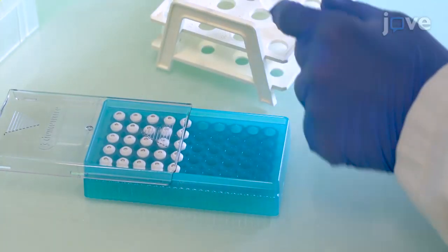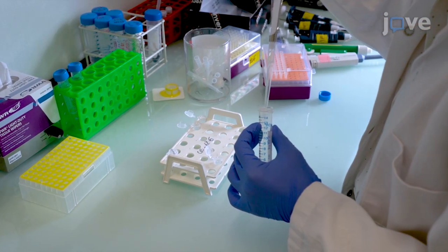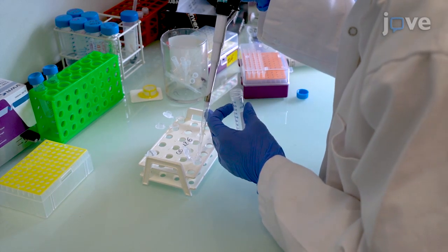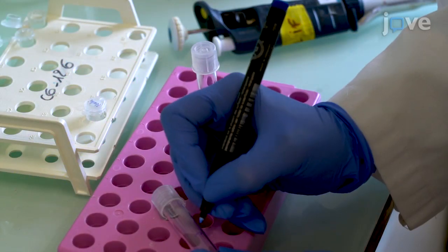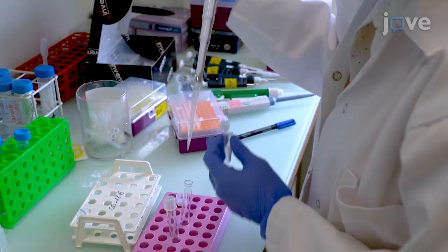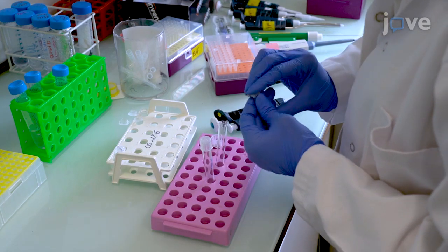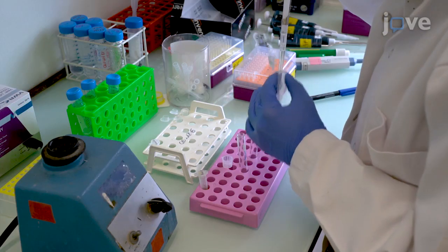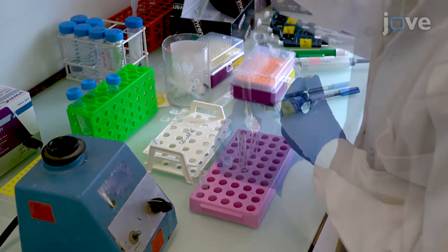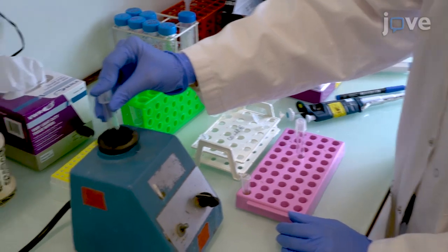Before performing FACS, filter the nuclei with a 40 micrometer cell strainer into a BSA-coated tube. Dilute the filtered suspension by adding PBS with 5% BSA to a final volume of 1,000 microliters. Label two round-bottom FACS tubes as control and stained. Transfer 250 microliters of the nuclei suspension into the control tube using a BSA-coated pipette tip. Transfer the remaining 750 microliters to the tube labeled stained, add 1 microliter of HOECHST dye, and mix by slow vortexing.